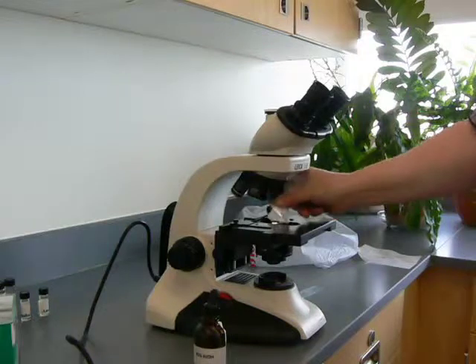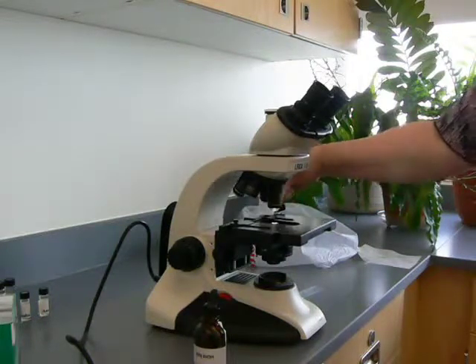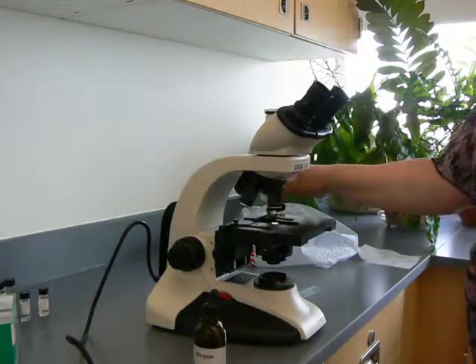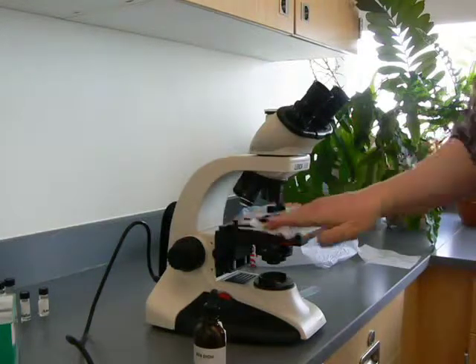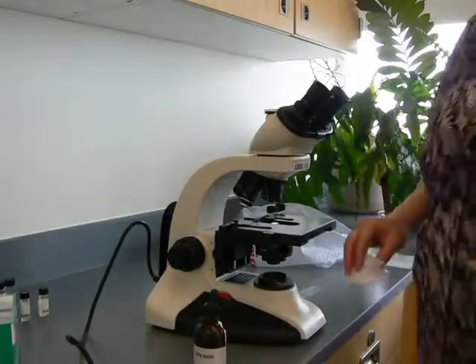Sometimes it shows up on the sides here, particularly if you've been turning your objectives improperly. But it's always good to wipe them off with a little bit of alcohol. Wipe down the microscope everywhere else where you may have oil. Take care, bye.